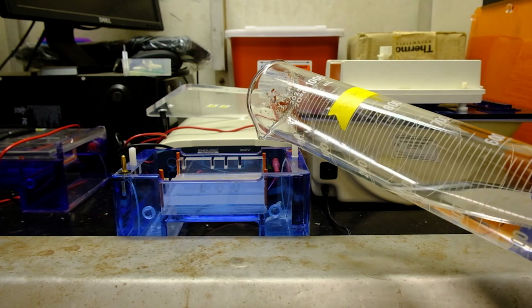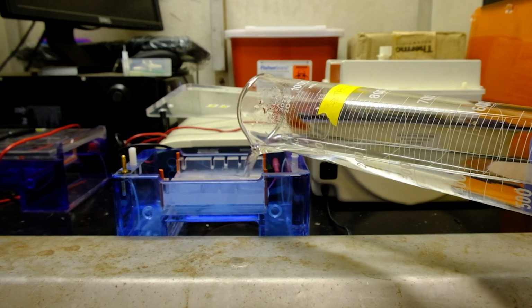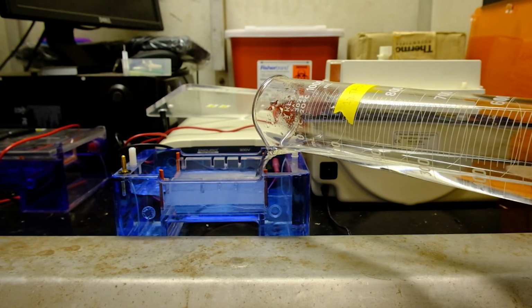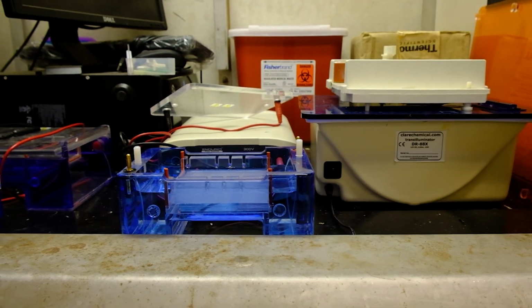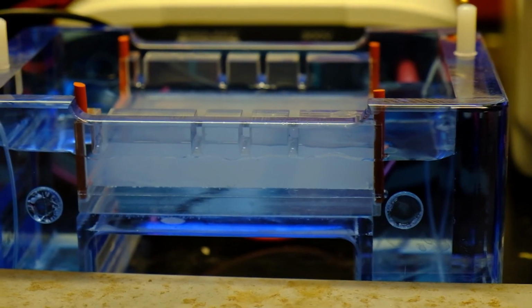Fill the chamber with TAE buffer until it fully covers the gel. The gel should be right below the surface of the buffer.